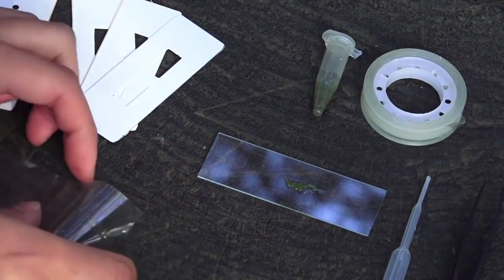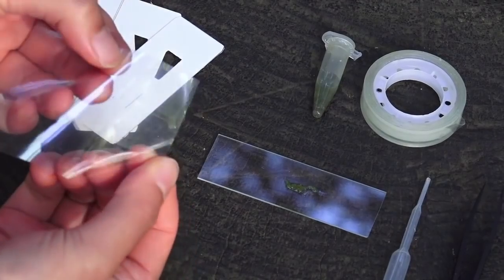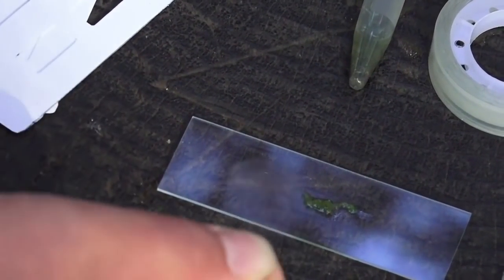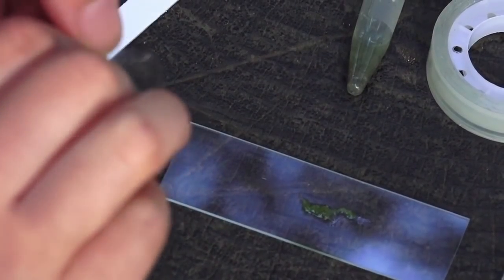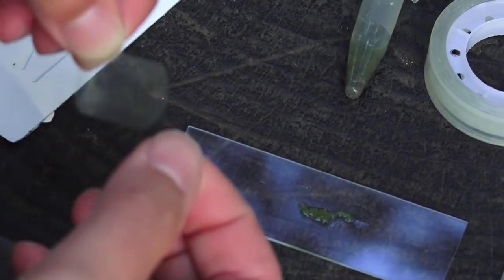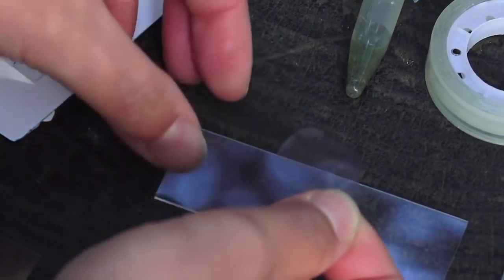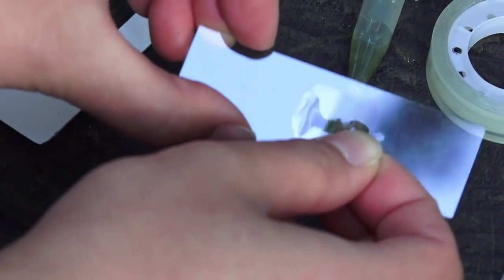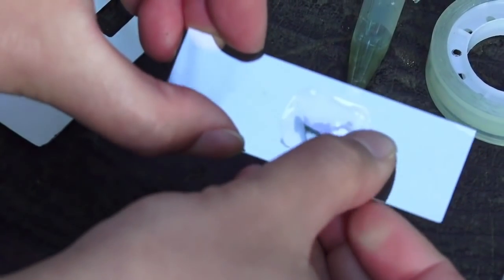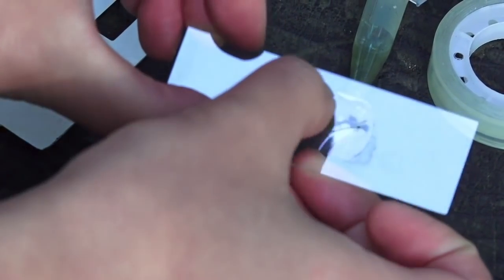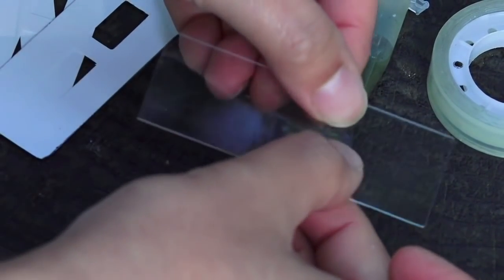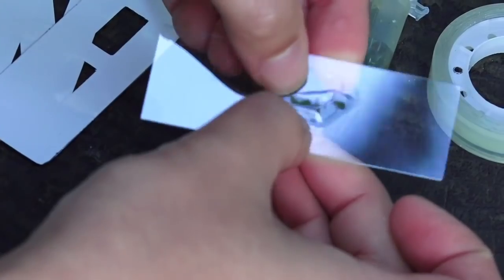Then your kit comes with a cover slip stickers. Just take one of this and then make sure you're holding the edges so that you don't leave your fingerprints right in the middle. And place it right on top of your specimen like so. And it should stick pretty firmly like so.